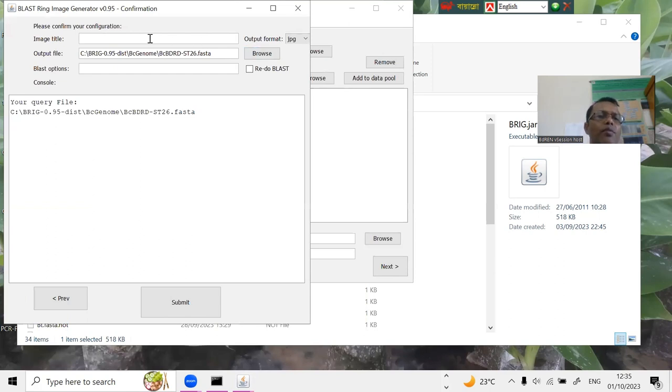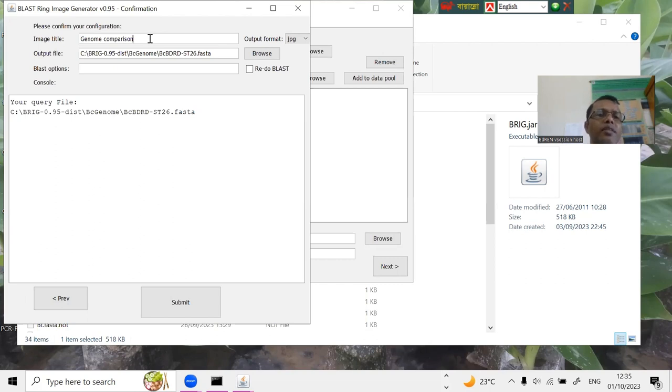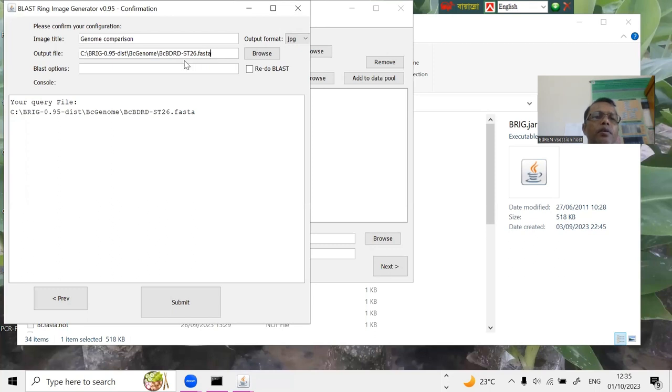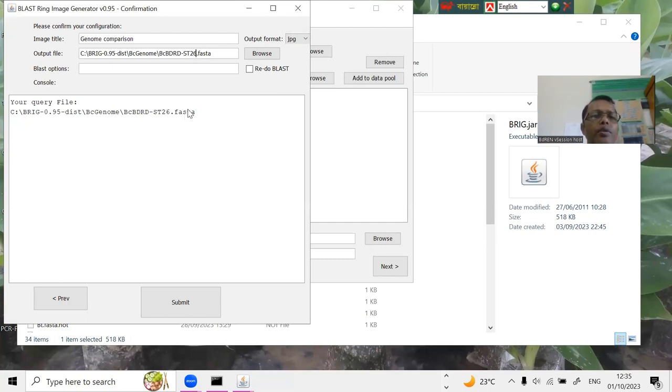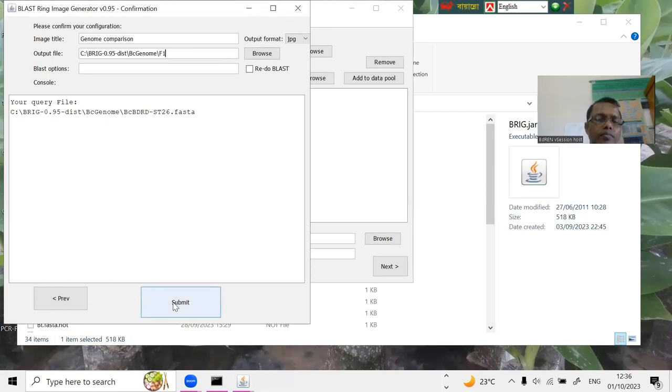So, what will be the name of the image? So, let's say, genome comparison. You can write the image title. And, output, that could be output, say, fast format output file. So, okay. Okay. And, this one. So, I can write. Okay. Now, your query file, this one. Okay. Okay. You can now submit.